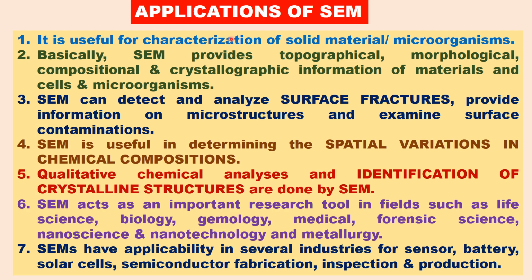Now let us see the applications of SEM. It is useful for characterization of the surface of solid materials, microorganisms, cells, viruses, etc. Basically, SEM provides topographical, shape, morphological, compositional and crystallographic information of materials, cells and microorganisms. SEM can detect and analyze surface non-uniformities, surface fractures, and provide information on microstructure variations. It can also examine surface contaminations.